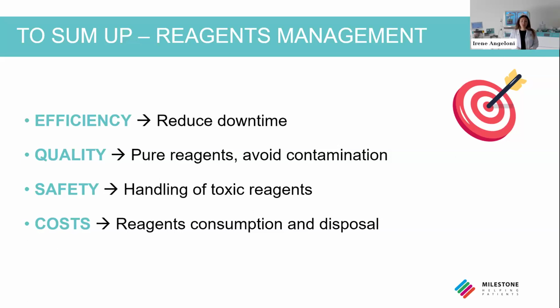We use reagents that are less toxic, such as isopropanol. So it's safer when you change it, when you handle it, when you dispose it. And in terms of cost, we reduce the reagent consumption and avoid the disposal of toxic reagents such as xylene. So this was, to sum up, the second key element, that was reagent management.